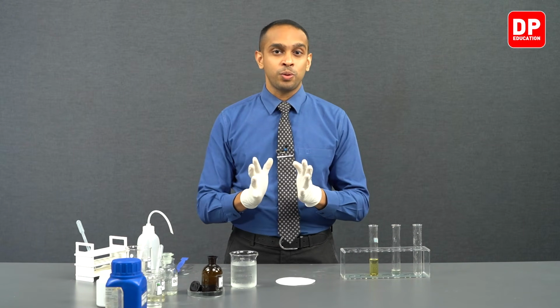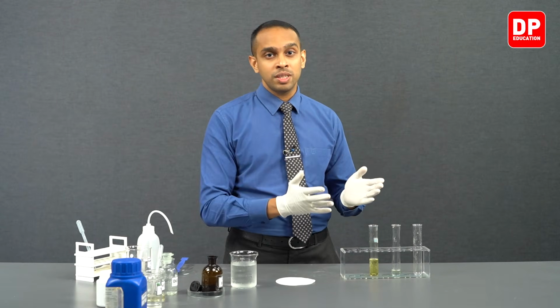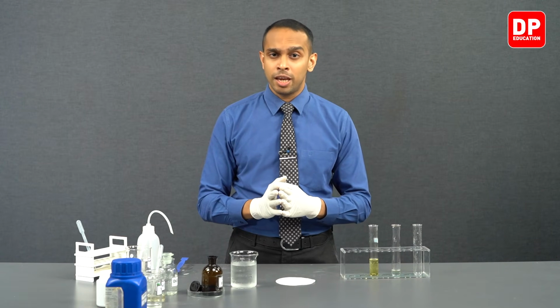So let's go through what we did in this experiment. We initially prepared a saturated Fe2+ ion solution by dissolving ammonium ferrous sulfate in water, and we have to make sure that we always freshly prepare Fe2+ aqueous ion solutions like this. Otherwise, Fe2+ ions on standing can turn to Fe3+ ions due to oxidation in air. So we will not be able to observe this brown ring test if you are using an old Fe2+ aqueous ion solution. You have to freshly prepare your Fe2+ aqueous ion solutions.